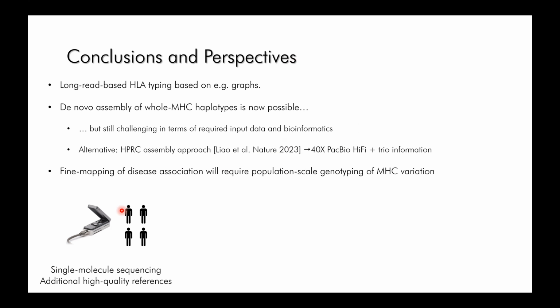We use single molecule long-read sequencing technology to generate additional haplotypes. For example, we are involved in a collaboration with Paul Norman's group to do exactly that for a few hundred additional haplotypes. We can then use these completely resolved sequences to build improved genome graphs.